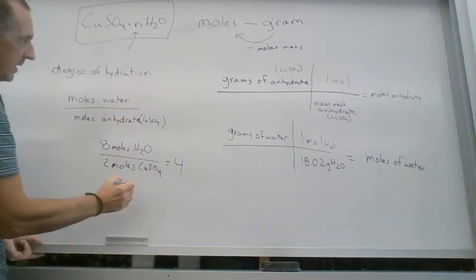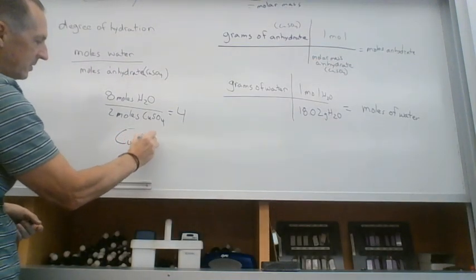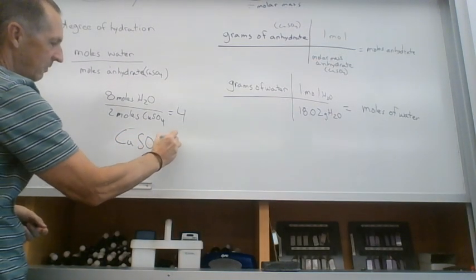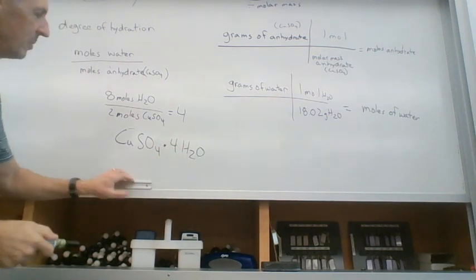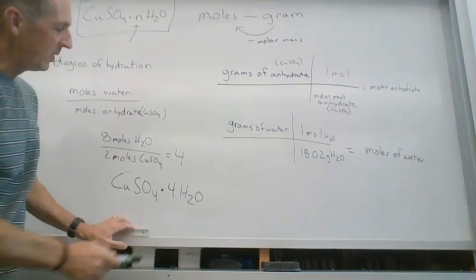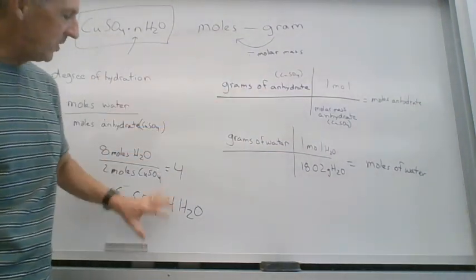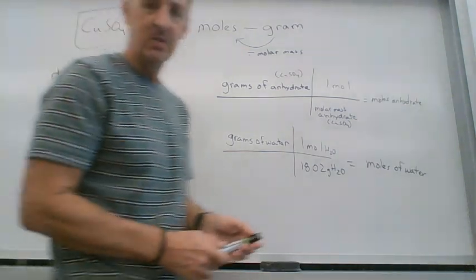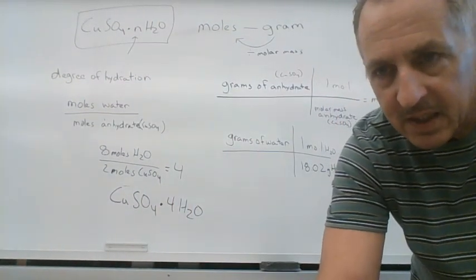So the formula for the copper sulfate would be copper sulfate 4 H2Os. And that's what we're trying to do in this experiment, is find this number. This is just a made-up number. When you actually use the data I gave you, you should calculate some degree of hydration. So that should be everything you need to complete the lab.